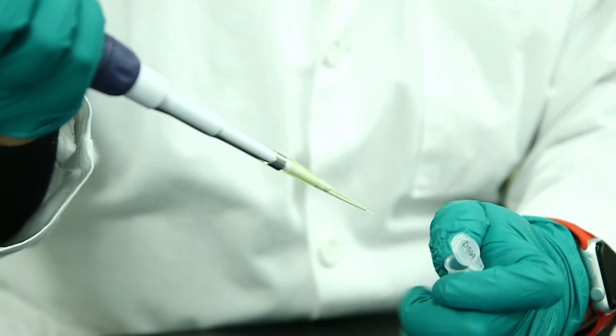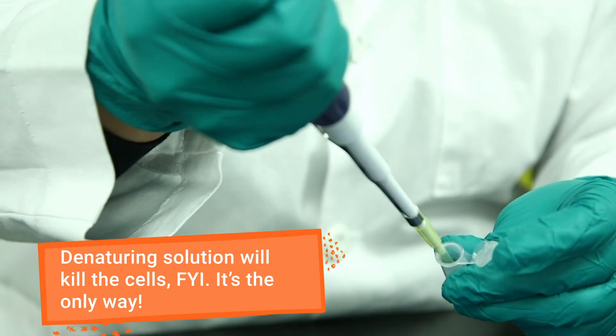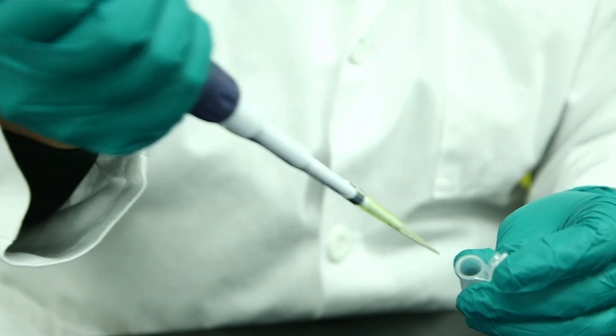Add a denaturing solution. This will raise the pH and lyse the cells, releasing their contents into solution.